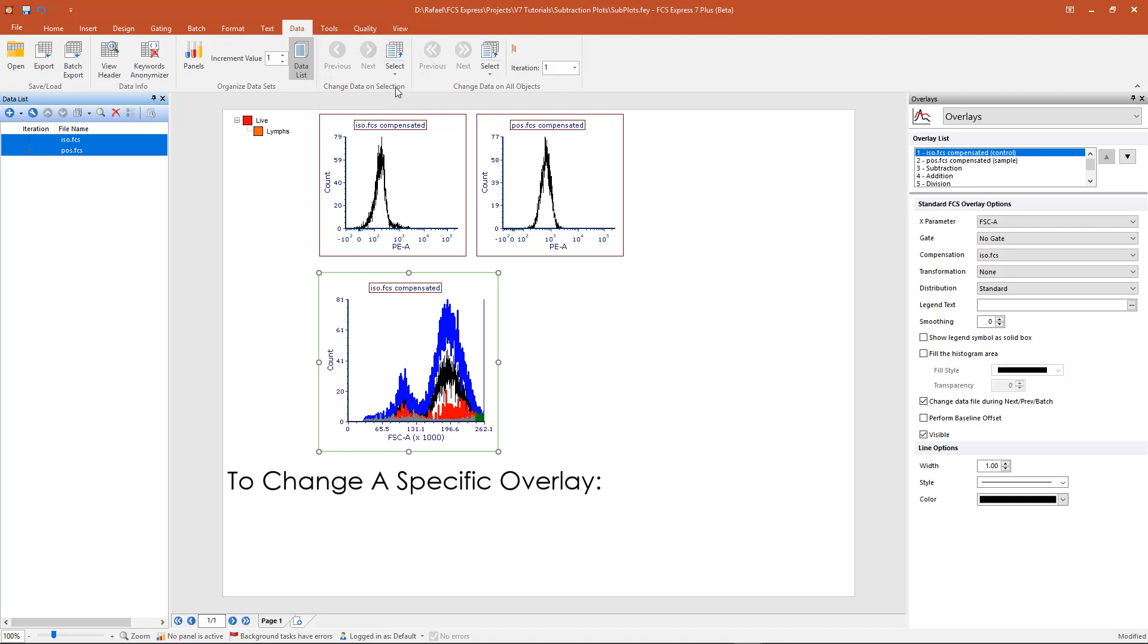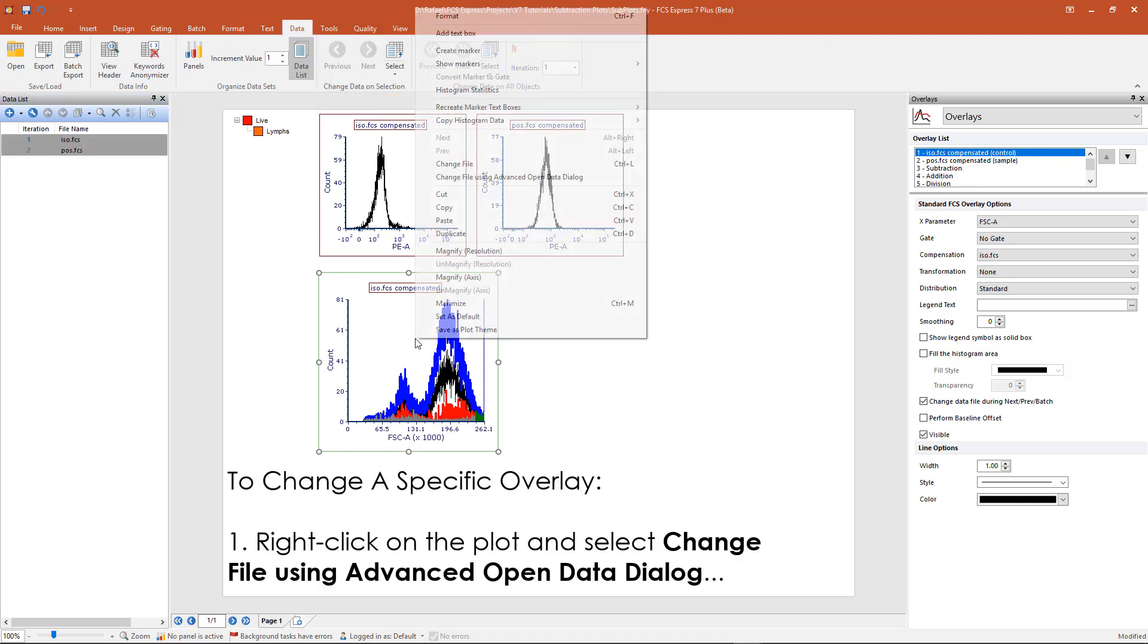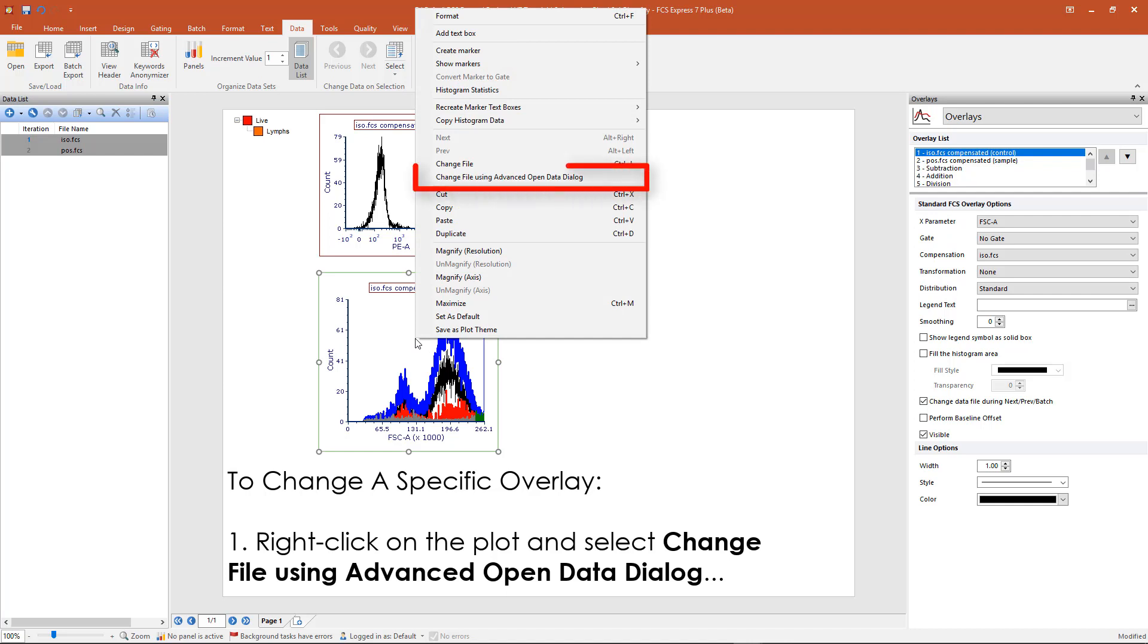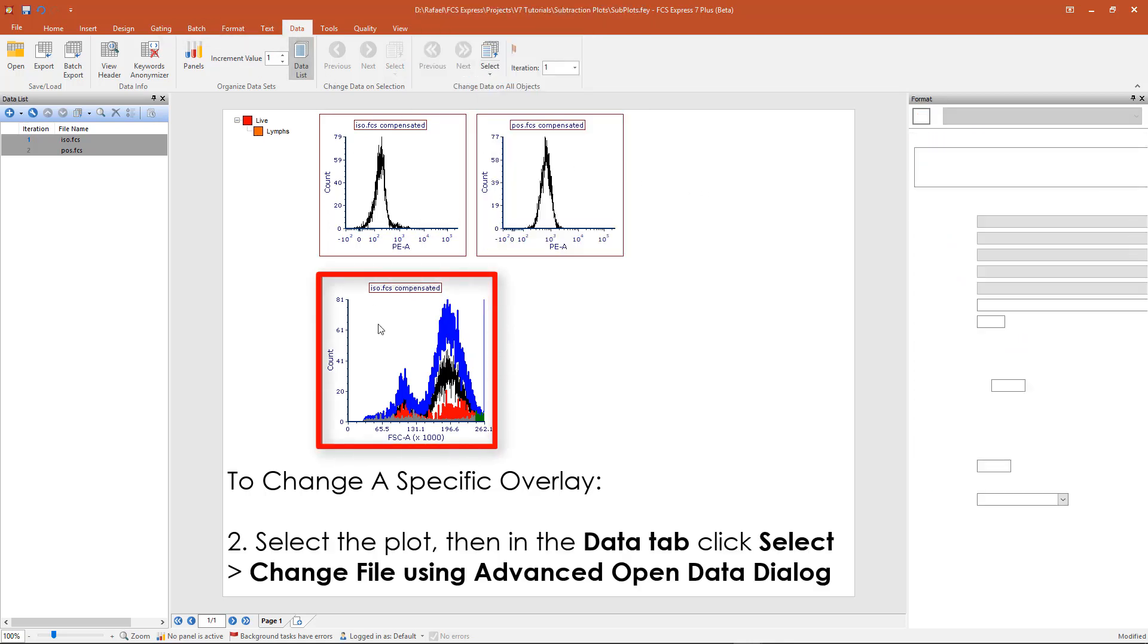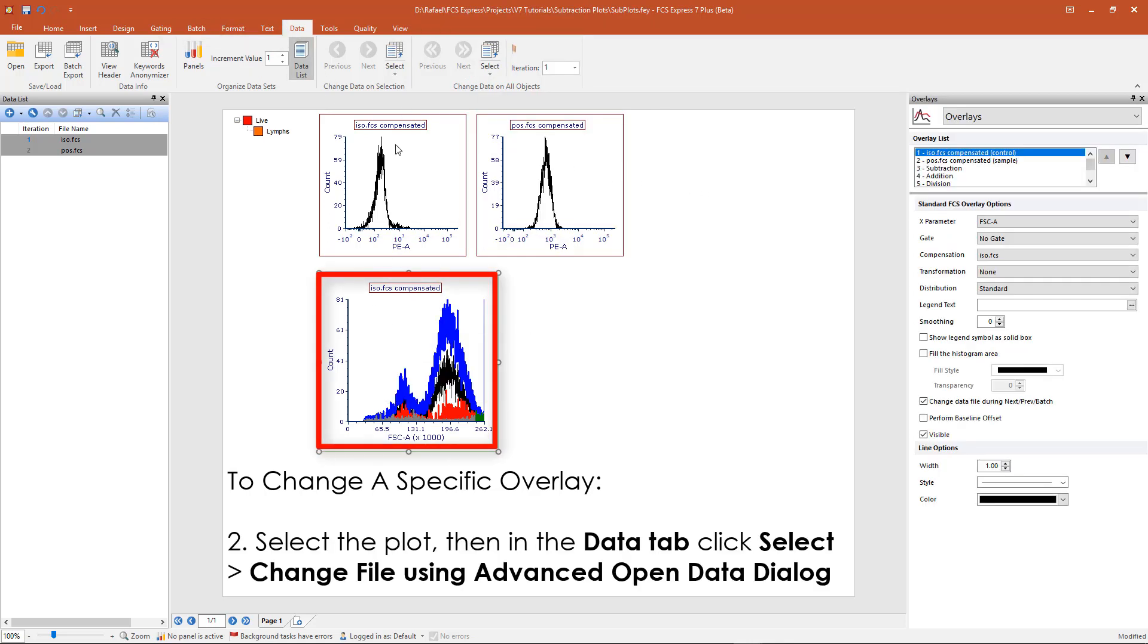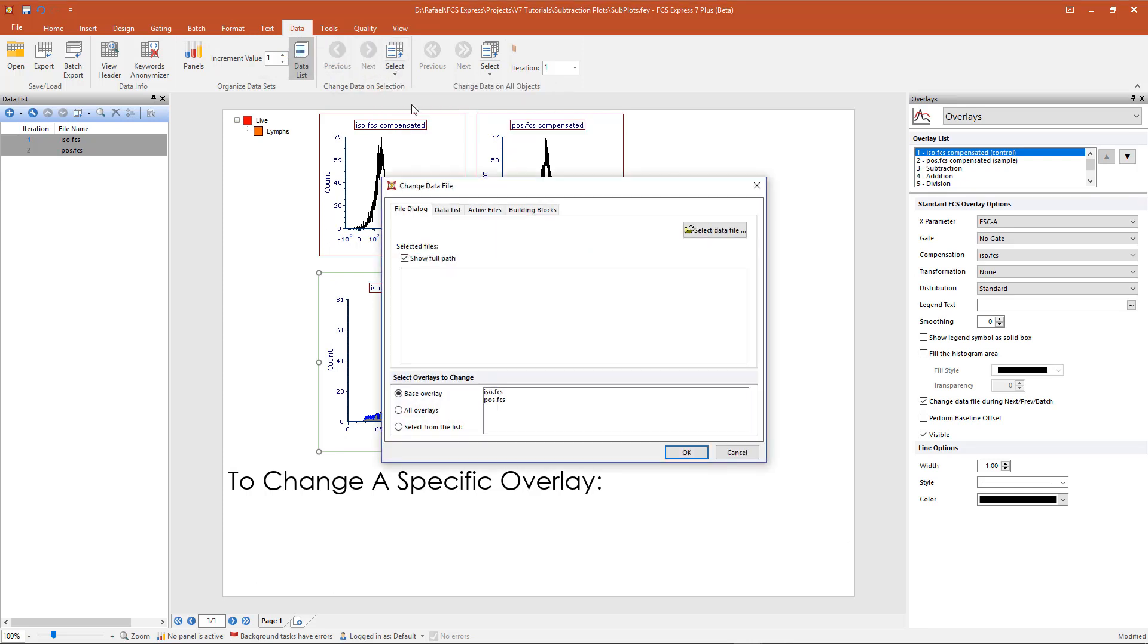You can also select a specific overlay to change by right clicking on the plot and selecting change data file to use advanced open data dialog, or in the data tab by selecting the plot and then choosing the select button and using the advanced open data dialog button.